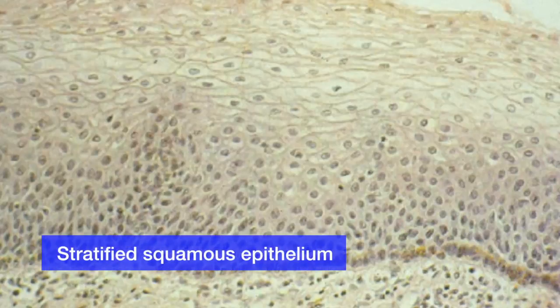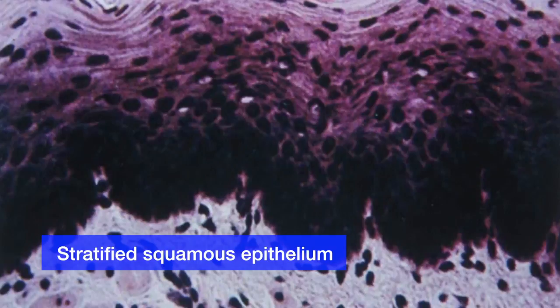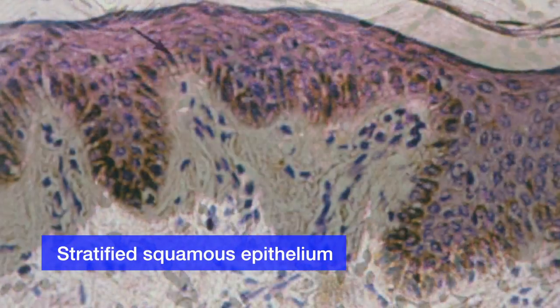The next one, stratified epithelium, is characterized by multiple layers of cells with typically flattened cells at the outer surface. So the complete name of this tissue is stratified squamous epithelium. Again, you see flat apical layered cells with more cuboidal basal cells that continually divide.